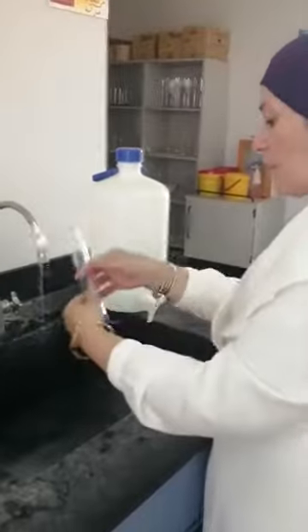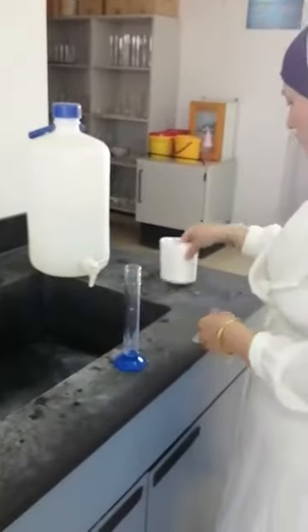Cleaning the same cylinder from the content of zinc oxide and water.